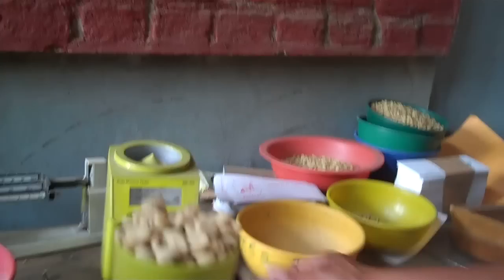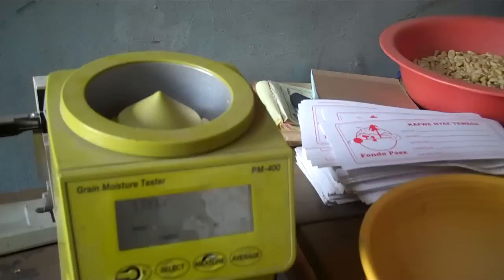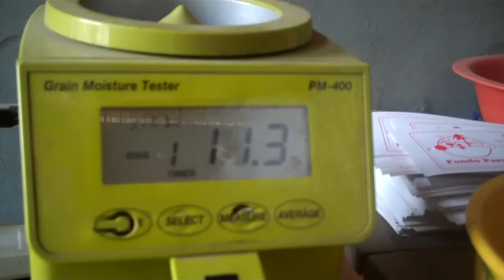Don Miguel said 250 grams is what they'll use to dehusk and then check for defects. He's stirring around the pergamino to get the humidity reading — it's a grain moisture test. The result is 11.3%. That's well within the target of 12% or less, which is excellent.